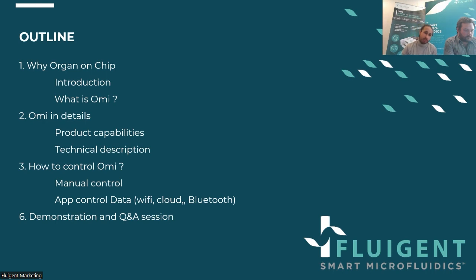And then at the end, I will propose you to have a nice interaction together. So we will have a small demonstration where we will present the project as much as we can. You will be able to see how we can open the OMI, how we can use every component. And in the meantime, you will be able to ask your questions directly.